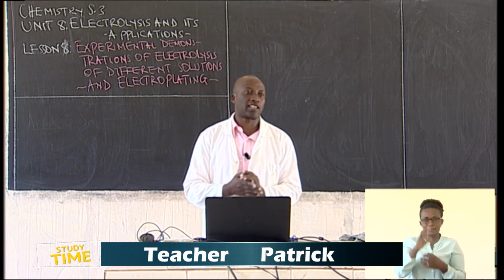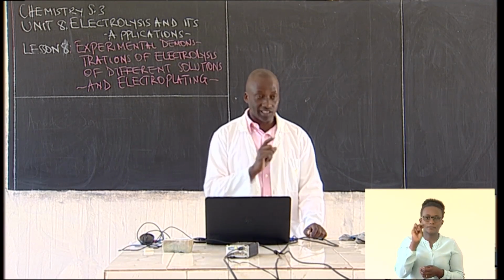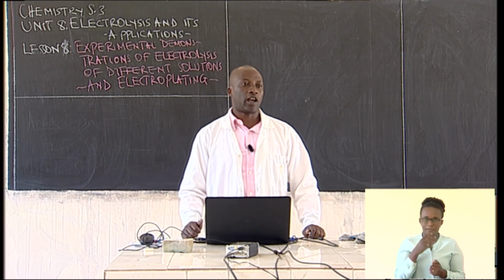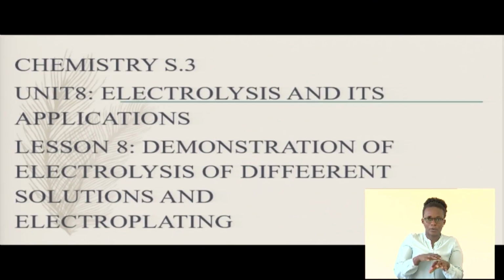I'm very excited once again to be with you in lesson number 8, and I'm sure this is the last one. We have gone along together, and I just want to thank you for being there. In lesson number 8, to be very specific, because we have looked at very different concepts, this time we are just going to look at electrolysis of different solutions.